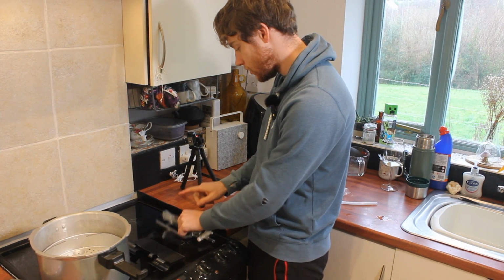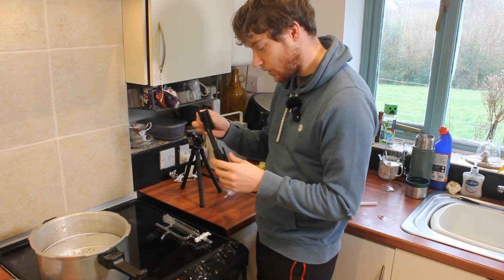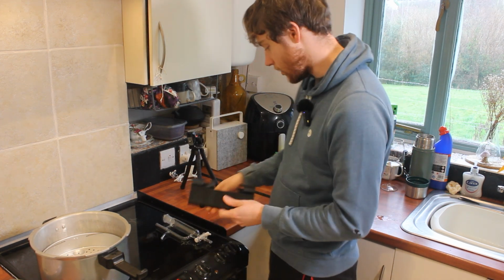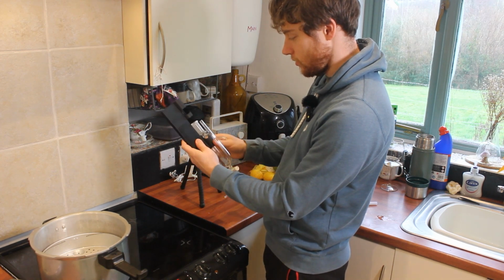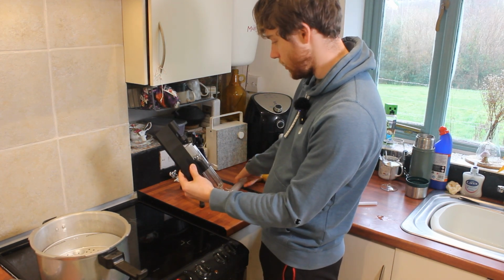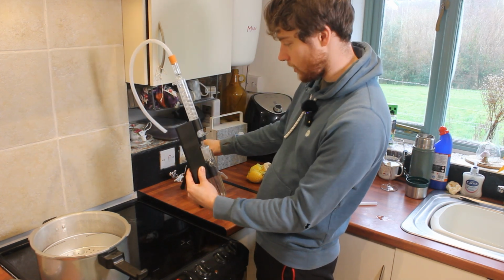So because of this new receiver, I've 3D printed another holster so it can hold this new receiver right underneath the condenser, like that. And that's going to attach to this tripod.